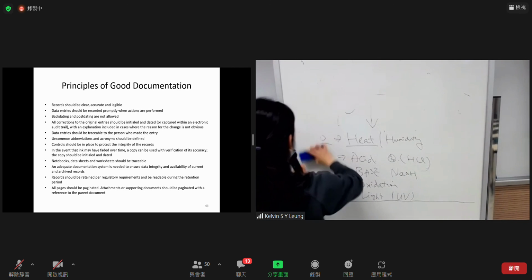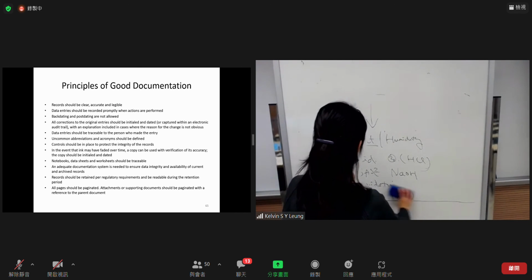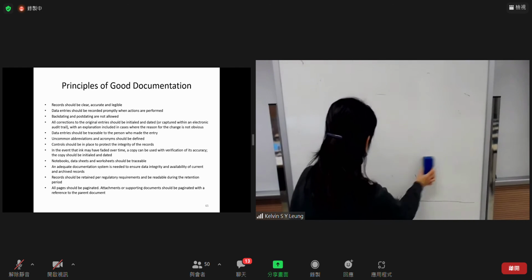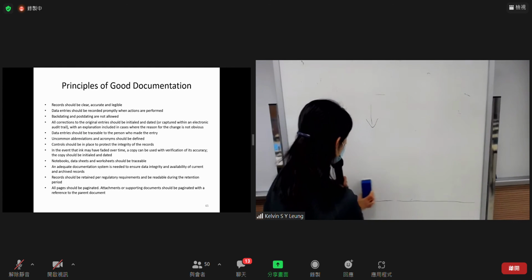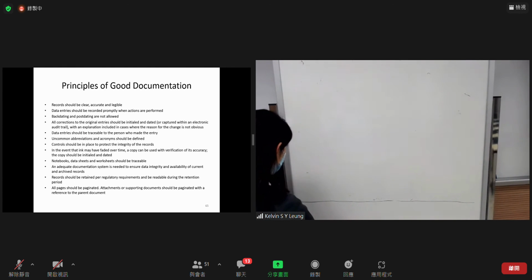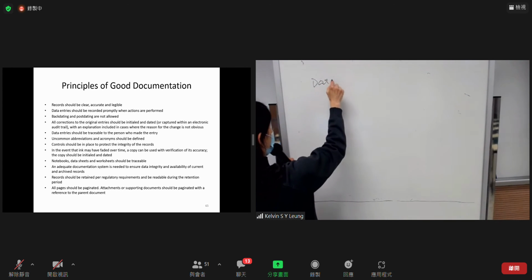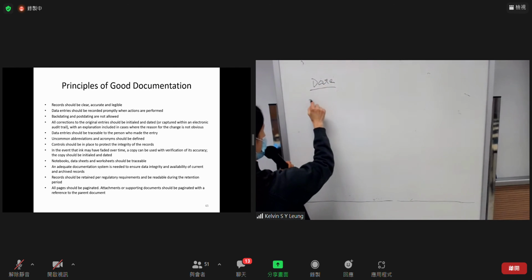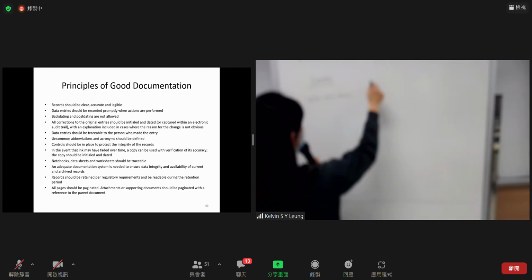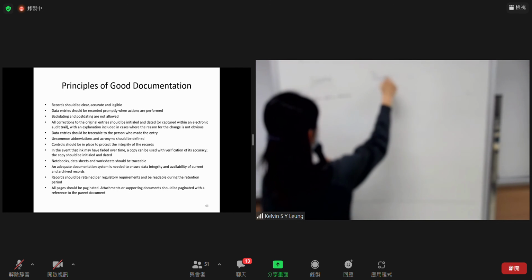If another person, analyst B, will use it in the afternoon, when he uses the HPLC, he should see my signature on the logbook, the date, and sometimes the purpose.